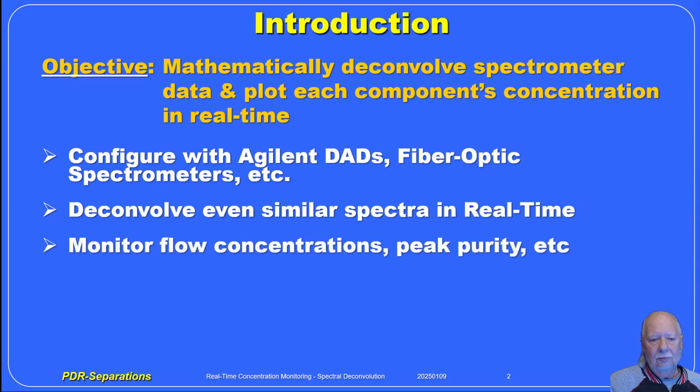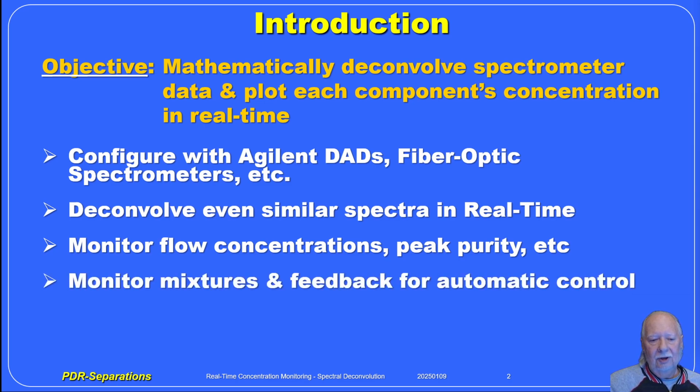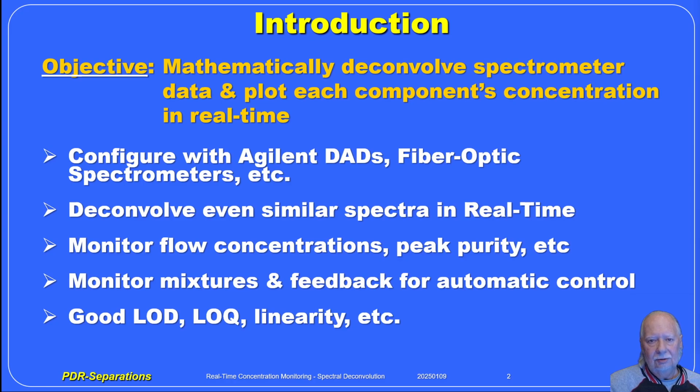We monitor flow concentrations, peak purities, etc. We monitor mixtures and feedback for automatic control of composition. We demonstrate good limit of detection, limit of quantitation, linearity, etc.